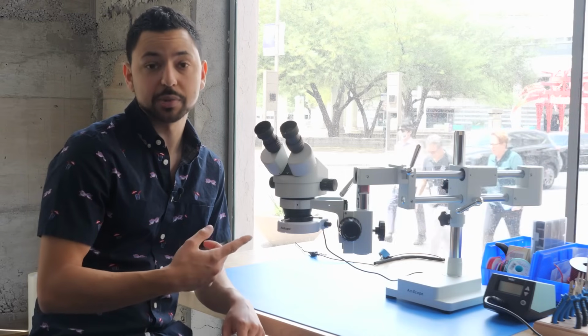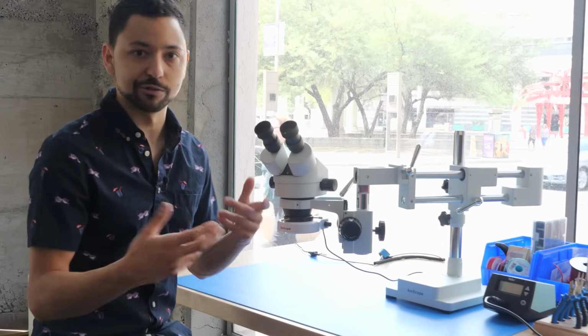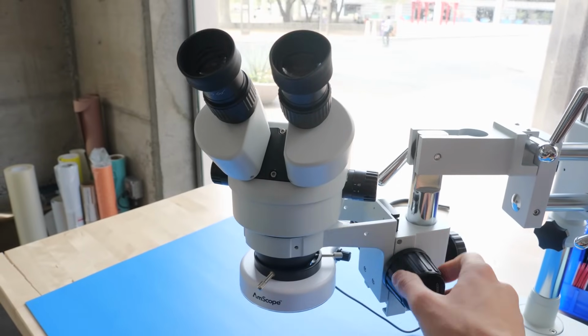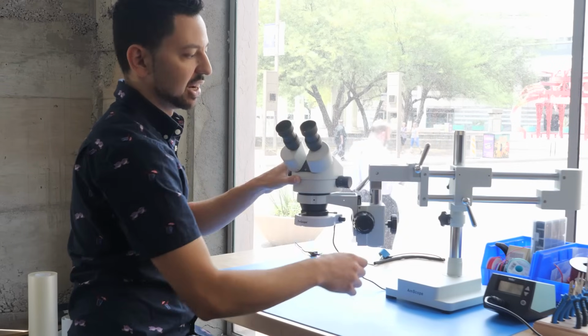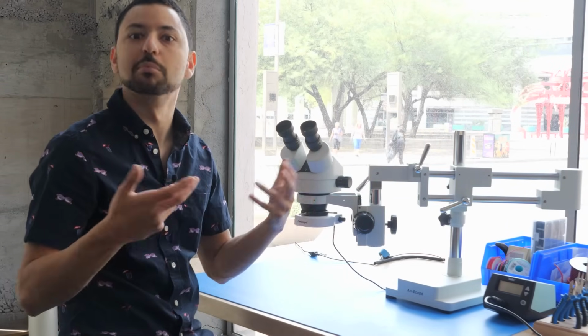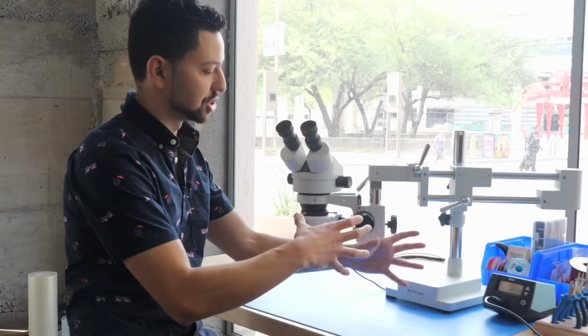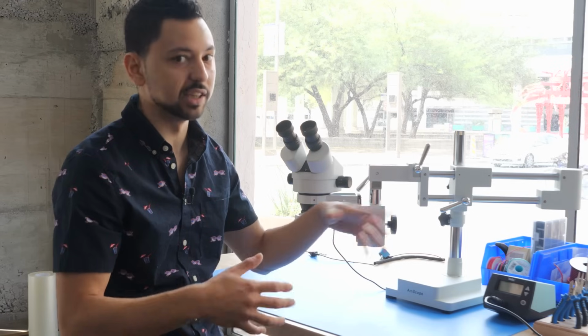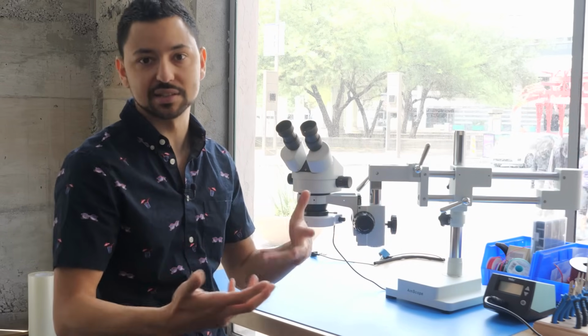This particular microscope that we got is a relatively more expensive model from Amscope. Particularly, the expense comes from it being able to swivel in all these directions, be able to go in and out, but you don't necessarily need all of this ultra fancy functionality for most work. In fact, if I was going to buy one of these for myself, I would get a unit that is just on a single stand that you can't move around at all, because that will decrease the price that you're paying into a really beefy, extravagant stand, and the price that you're paying into the microscope is actually going into quality of optics, as an example.